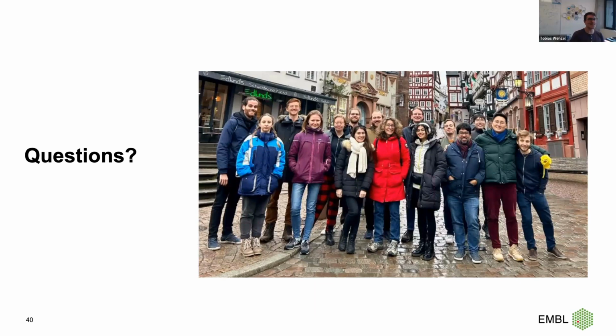Thank you so much, Dominik. It was really fascinating. It's even way cooler than I thought. I have a lot of questions, but I'm sure some other people might have too. This is the advantage of joining us in the live session. I know that many people watch them afterwards, but only here you get the convenient opportunity to ask direct questions. Was anything unclear in terms of content or language for anyone, or do you have a follow-up question? Please go ahead. Okay, Maria.